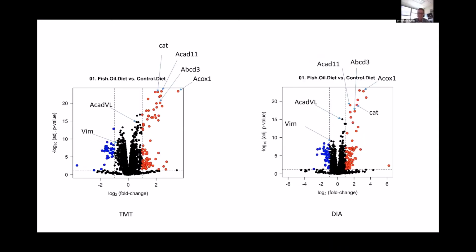Another question I had, sorry, because you were pointing out that TMT has much more missing values than DIA. So overall, there are less identified significant proteins. Is that because we're dealing with more missing values and it's not as sparse a data set, but it's more sparse than the DIA? So that accounts for that difference?